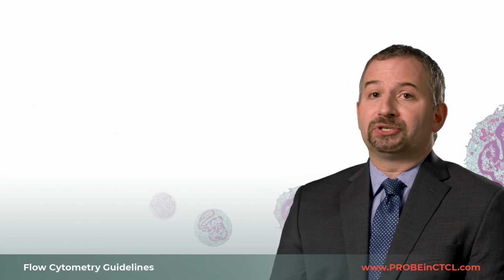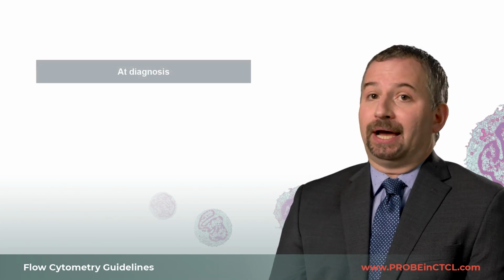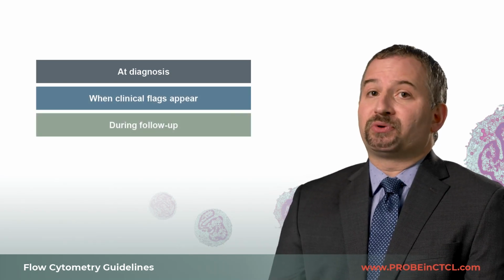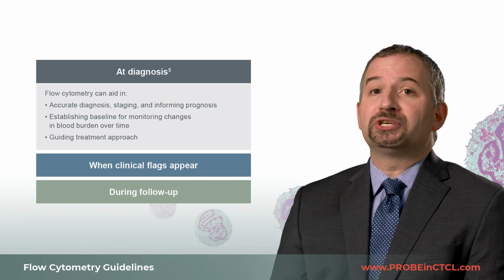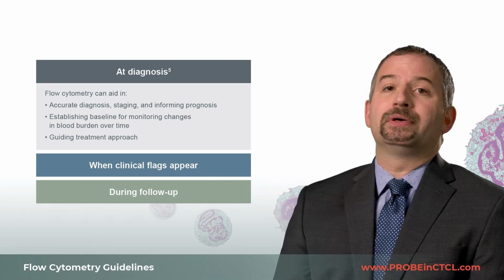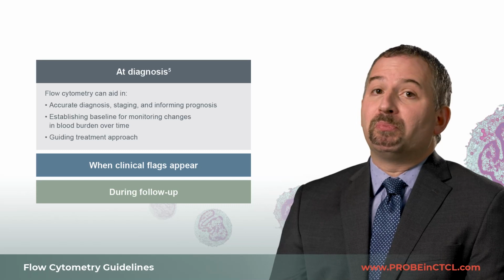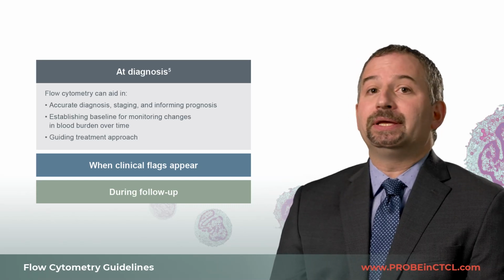According to recently published consensus guidance, flow cytometry is recommended at diagnosis, when certain clinical flags appear, and during follow-up. Here are the consensus recommendations. At diagnosis, an initial blood evaluation for all suspected Mycosis fungoides or Sézary syndrome can help with accurate diagnosis, staging, and informing prognosis. Establishing a baseline, which is important for monitoring changes in blood involvement over time, and ultimately guiding treatment approach.